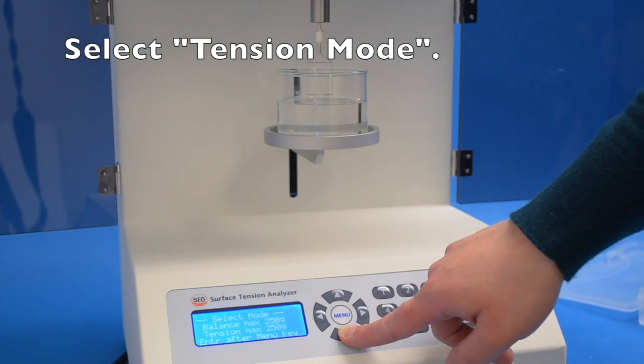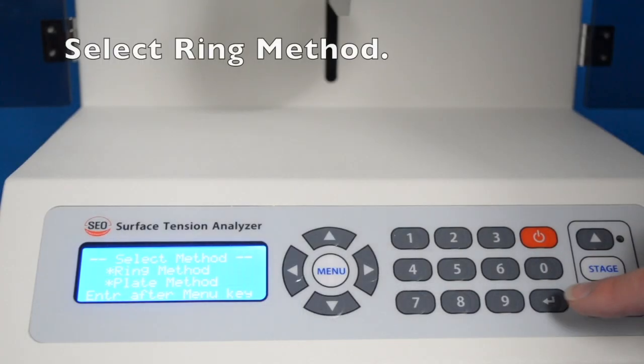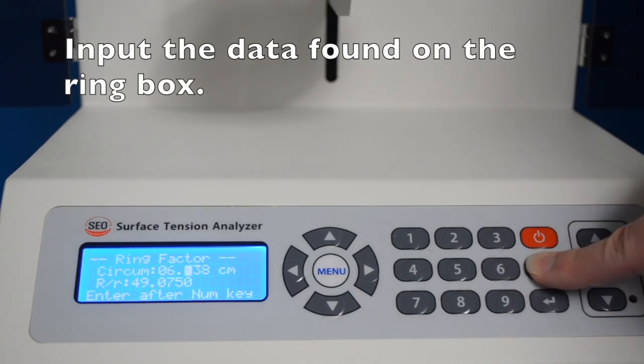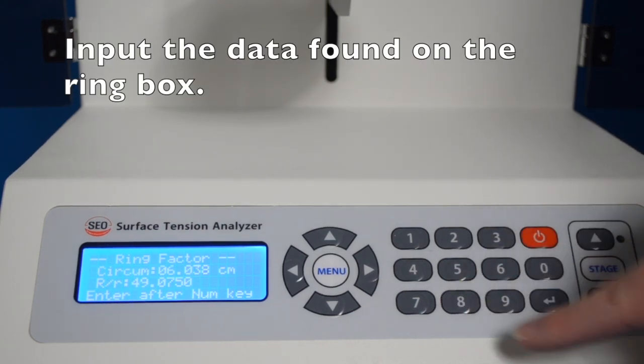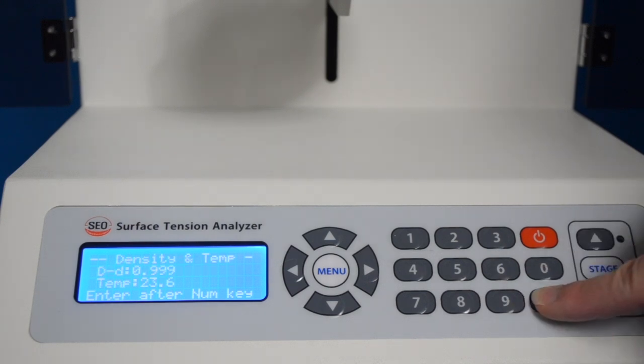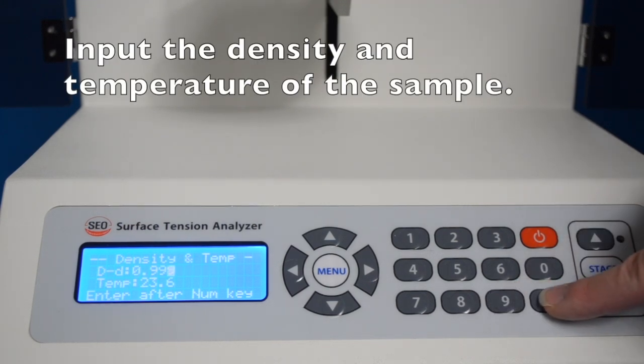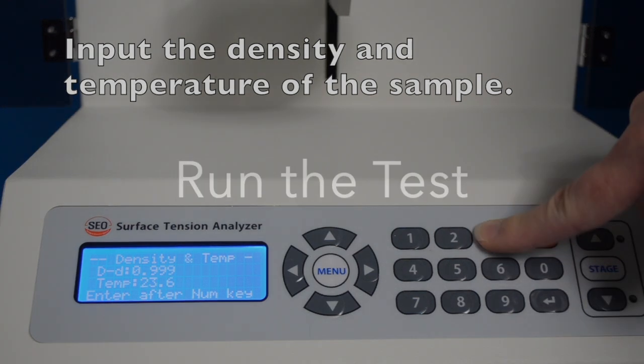Here is a quick review of the instrument's parameters. First, you select ascension mode, then you select the ring method. Then you input the data found on the ring box. And finally, you put in the density and temperature of the sample. That's all there is to it.